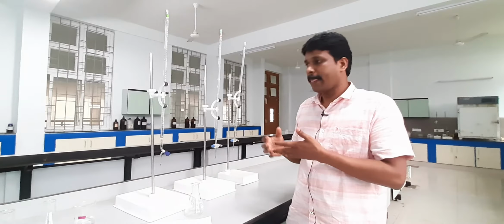Then once that is done, you have to take another composition of acetic acid and chloroform, and again you do the titration and find out how much water is required. That required quantity we can estimate by the end point. End point is turbidity. Okay.